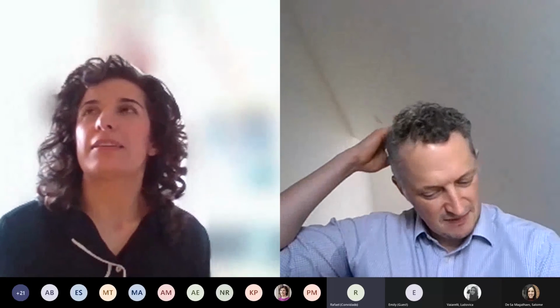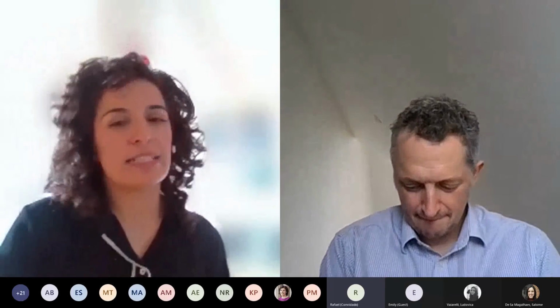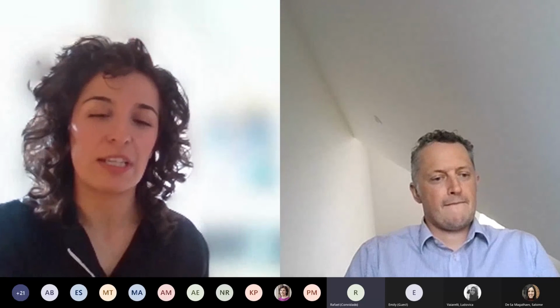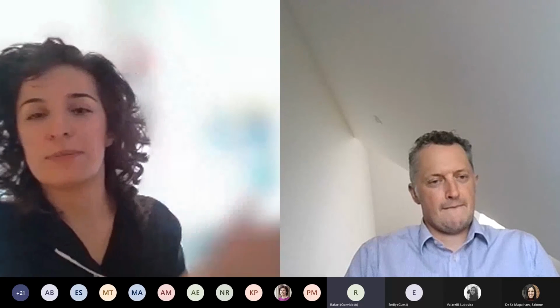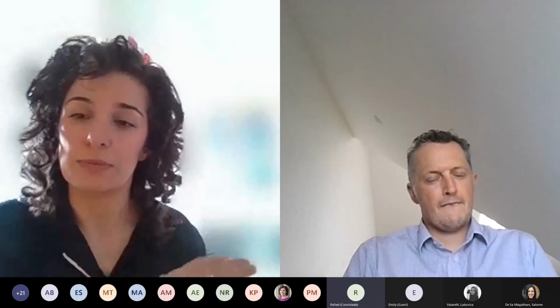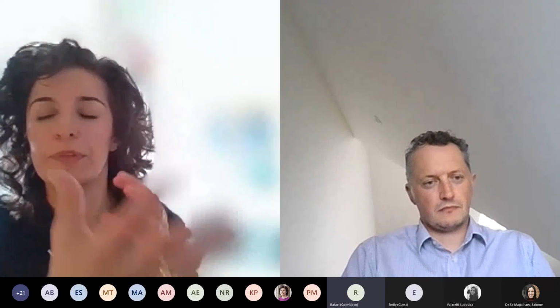Again, so this is potentially quite subjective, right? Because you can say, how accurate is it in comparison to manual annotation? How accurate is it in comparison to using different image analysis software, or how accurate is it comparing AI versus non-AI? So we are comparing all of those things, and we're really looking at the pros and cons and what we can improve.